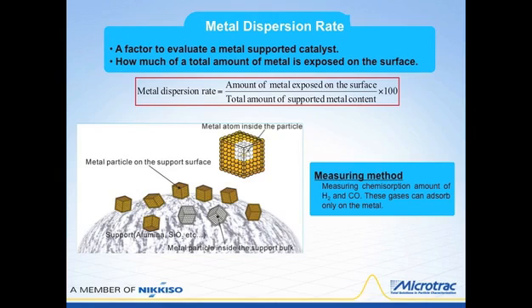Now, the issue here is that we can have these metal constructs, but these pieces of the metal structures are embedded inside the alumina and the other parts of the superstructure. And as a result, these platinum and palladium atoms are not available to aid in the conversion of the noxious gases. So it's very important to find out how much of these metals are actually on the surface and available for chemical reaction.